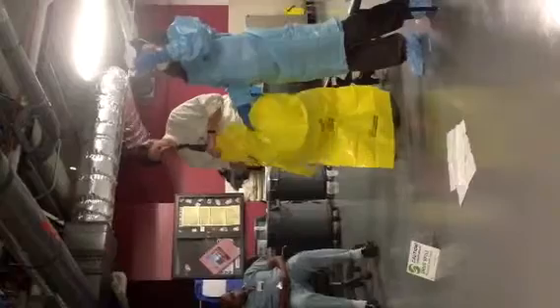So after you absorb them, in the kit you also have some kind of duster, scooper. Say if it's fully absorbed, you might want to use the scooper. Don't use your bare hand because you want to reduce contamination as much as possible. Try to scoop it in and then put it in the yellow bag.